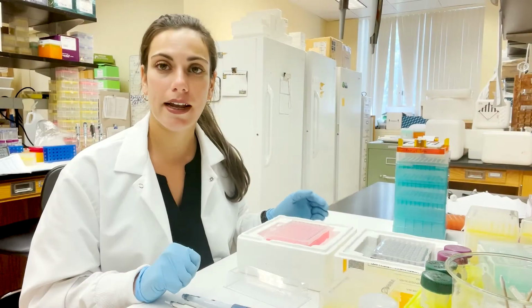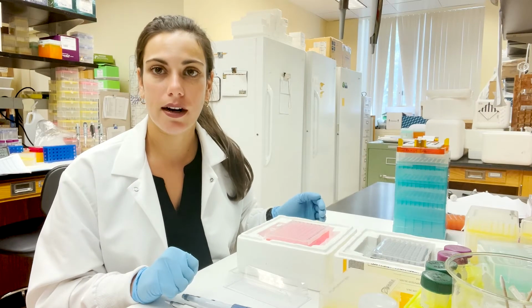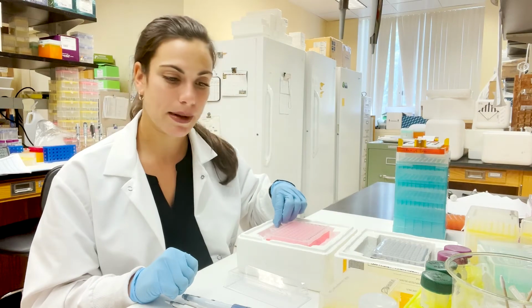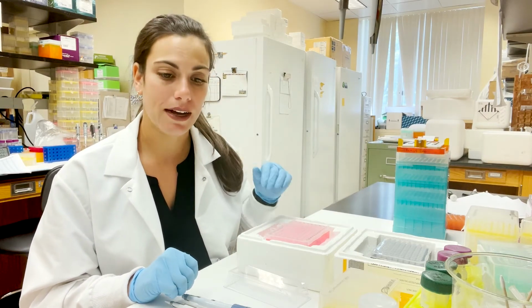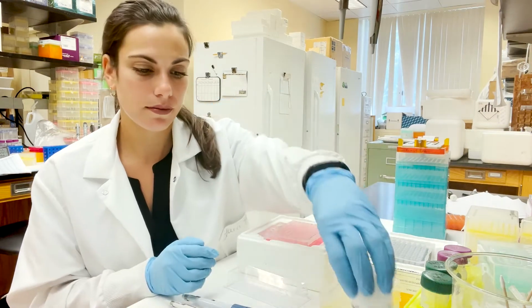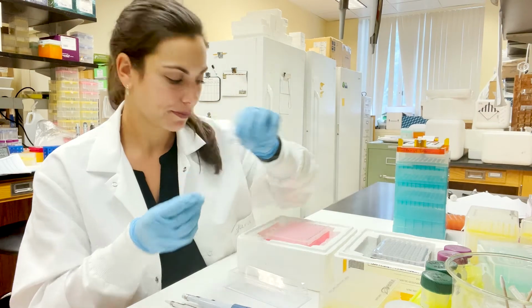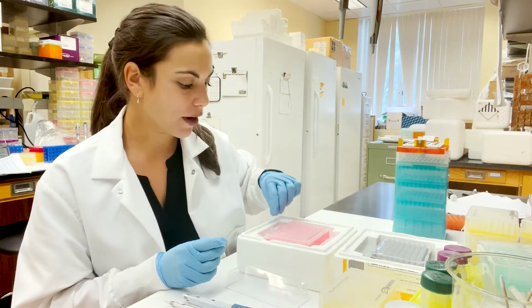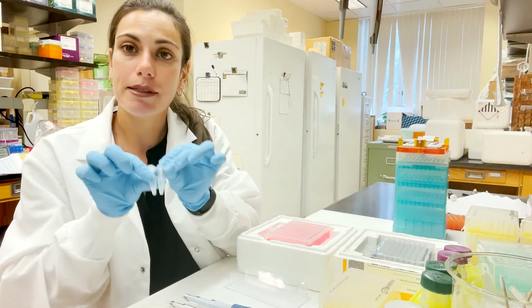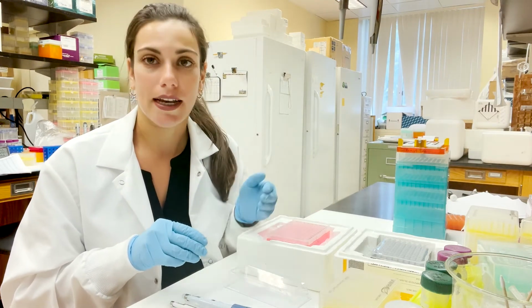Our next step is to amplify the clean DNA from the previous step using PCR. And the way we do so first is by creating a master mix. And in this master mix, for every well, we'll have 16 microliters of nuclease-free water, 5 microliters of 5x master mix, and 0.5 microliters of each primer, primer 1 and primer 2. Now these primers are designed for amplifying the common adapter in the ligation step.